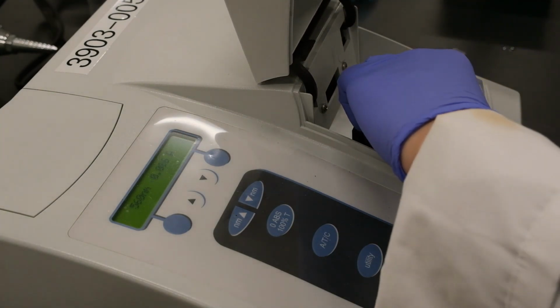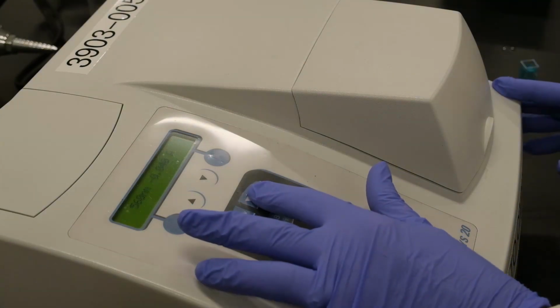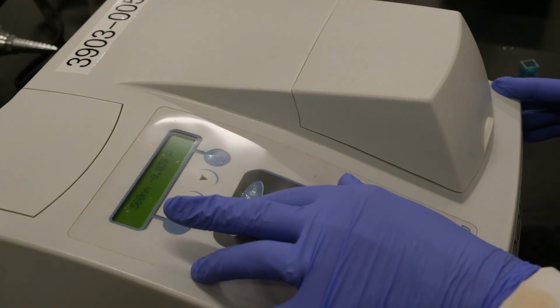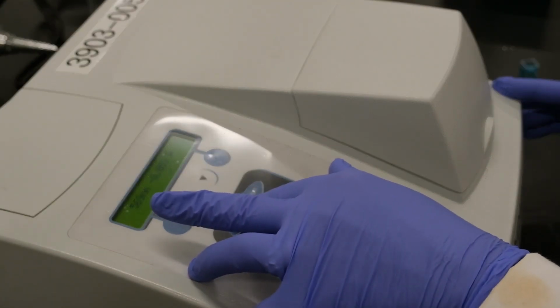We remove it. We increase the wavelength by 10 nanometers.